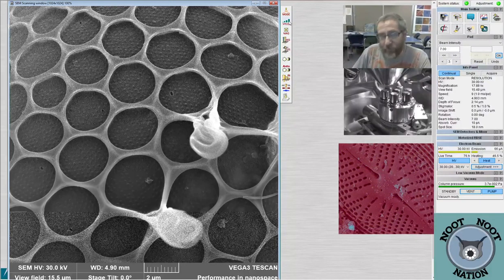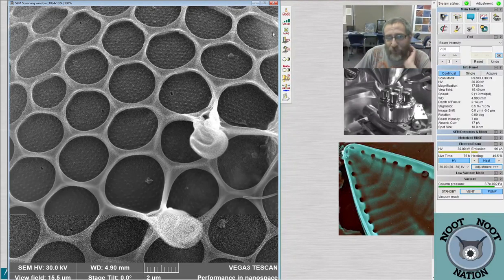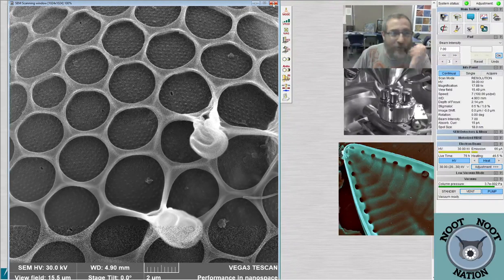And if I set it on the slowest setting, which is the highest resolution image it can produce, speed 10, it would take about an hour and a half. So for just this one image. And so we don't want to do that, mostly because people wouldn't want to wait around for one photo for an hour and a half.